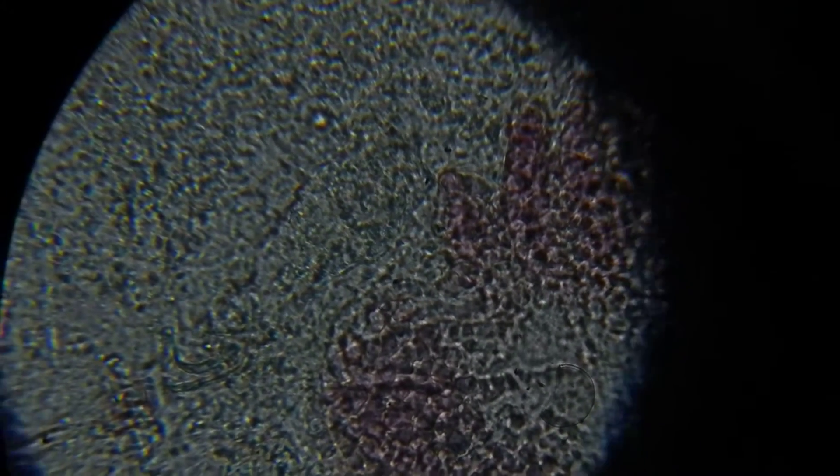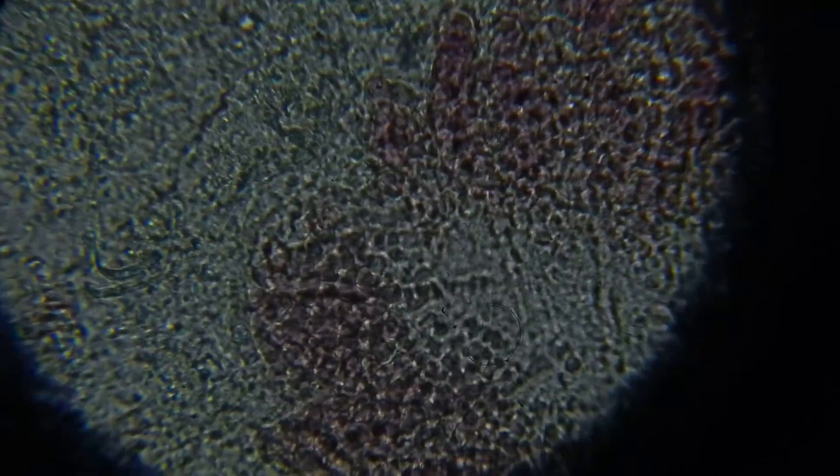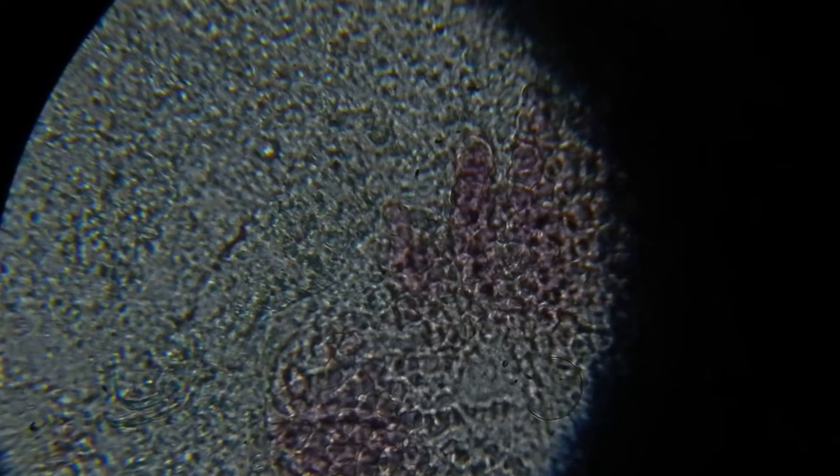This guy's not quite moving, maybe asleep. Oh yeah, you can only just see him moving a little bit. But that is a gill fluke. You can see that it's got some haptos on the left-hand side. I'll put it right to the corner of the screen so you can see it. And you see there's some motion in the middle there. So there, in the middle of the gills, is a fluke.